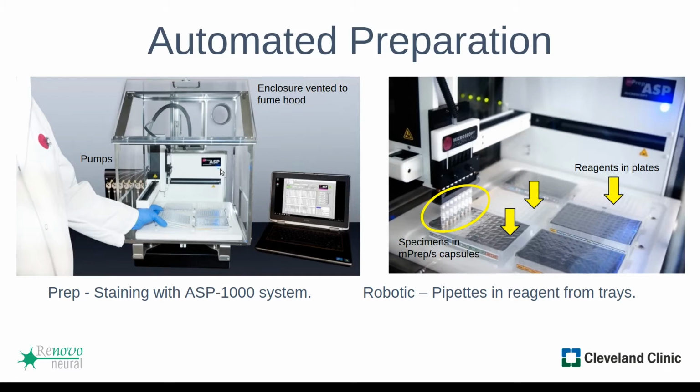When I was trying out the system, I played around with the organization of my solutions and plates to make cleanup easier. For example, a user could choose to put all things that are very hazardous in one plate. Then a user could put all the things that are not hazardous and able to be dumped down a sink into another, or any other variety of organization, the way they want to organize their things based on the workflow and their needs. So that does make cleanup easier, handling the used reagents easier.